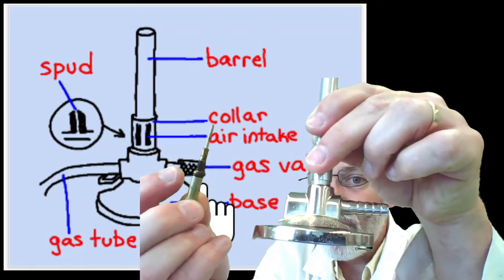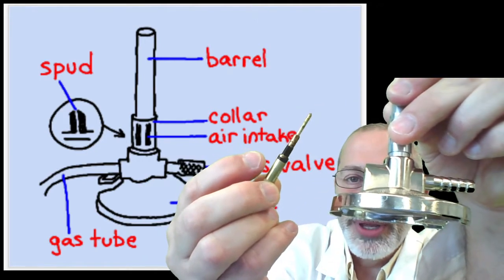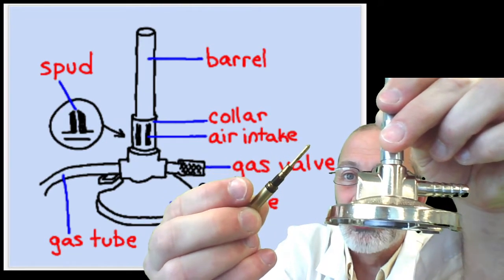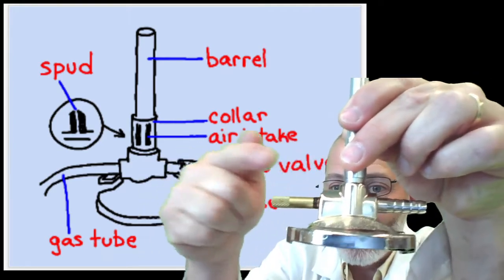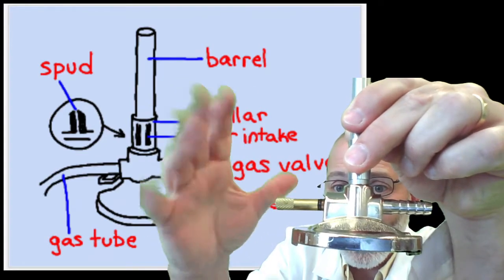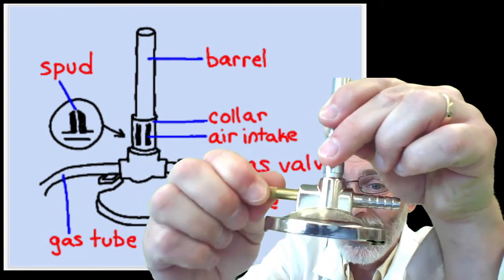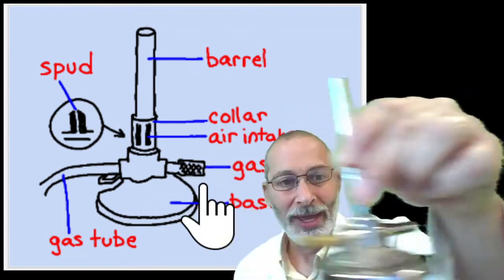There's a rubber O-ring there. Don't touch it. But you should never take out your gas valve so far as to reveal or expose the rubber O-ring, because if you do, there will be gas coming out of the bottom of the Bunsen burner, which could ignite right into your face or your hand. So if you see that little rubber O-ring, stop turning. Turn it the other way, righty-tighty, to close your gas valve. You don't want to open it all the way like that.